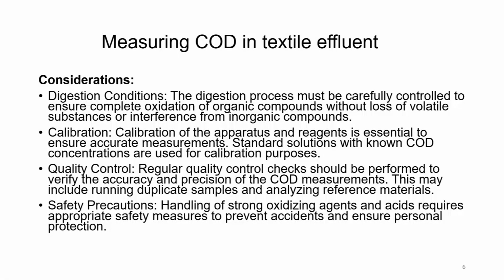This may include running duplicate samples and analyzing reference material, and sometimes even triplicates. Safety precaution. Handling of strong oxidizing agents and acids requires appropriate safety measures to prevent accidents and ensure personal protection. So, all good laboratory practices must be kept in mind.